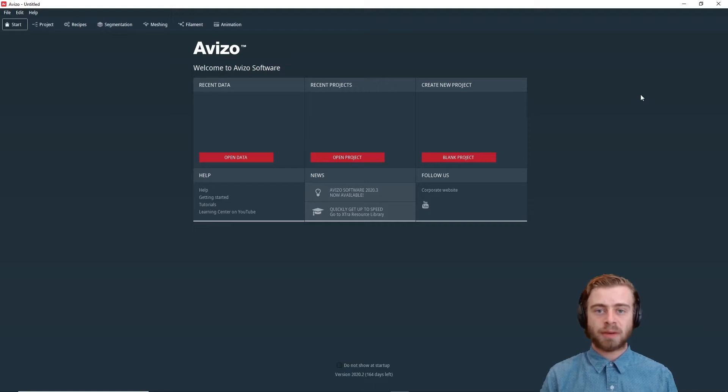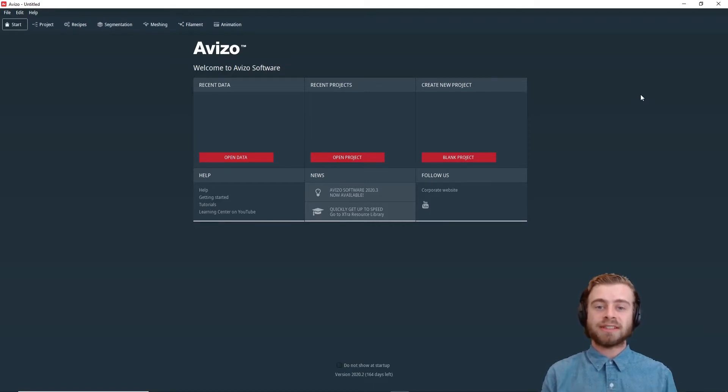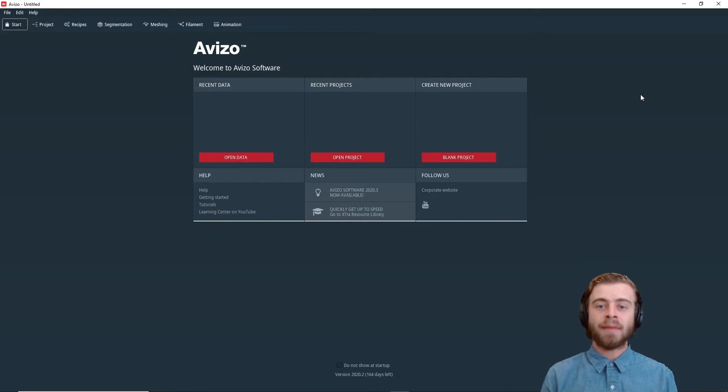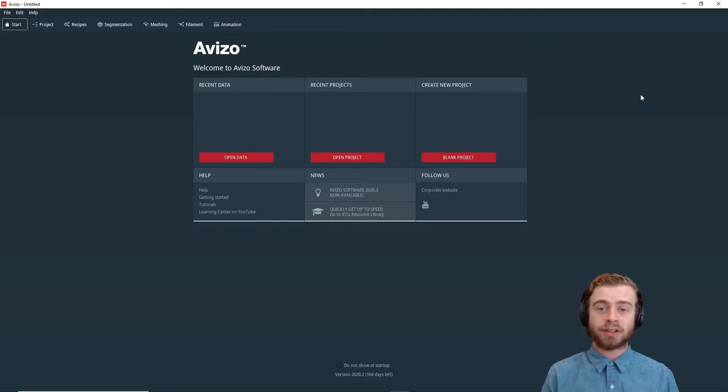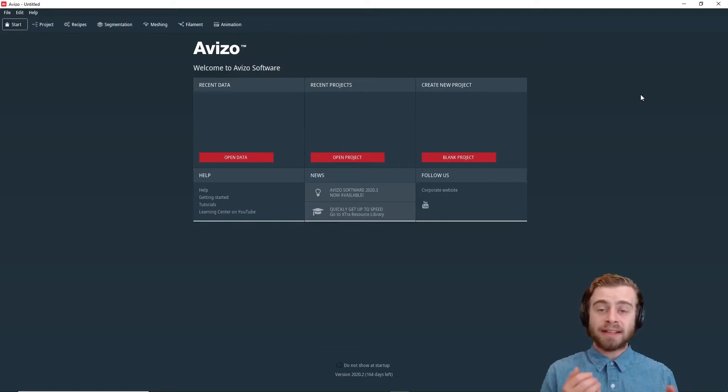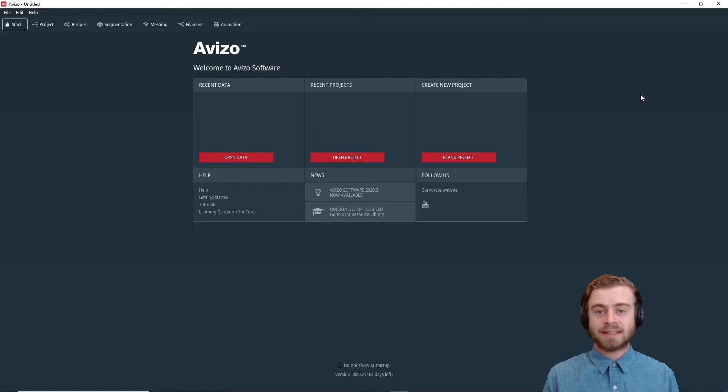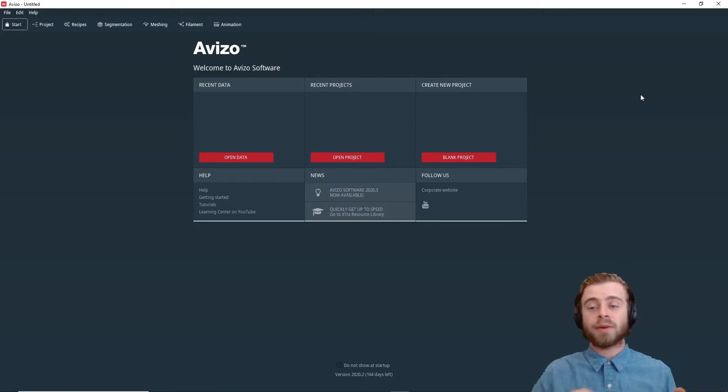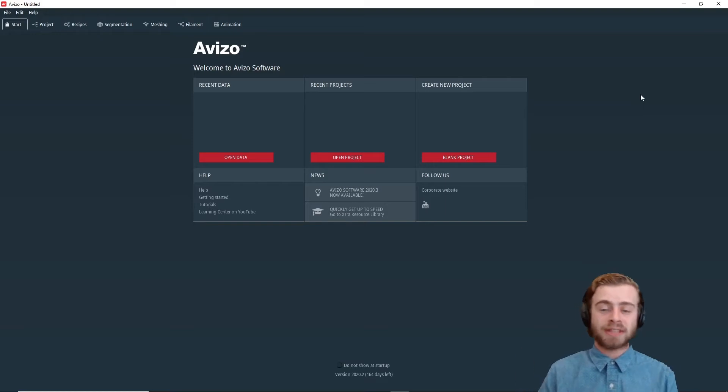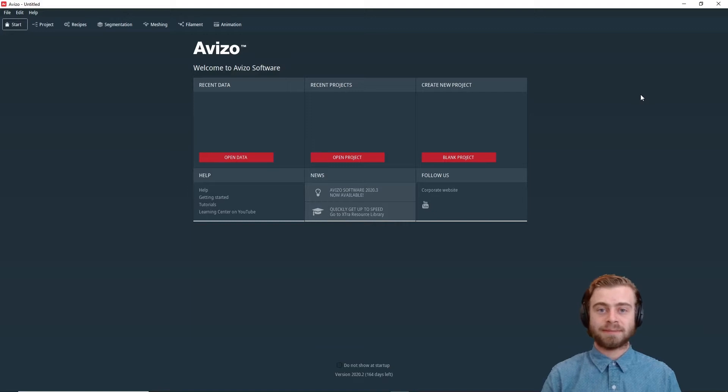The Image Stack Processing module allows you to create a workflow using just a single slice of a dataset and then apply that workflow on the rest of the dataset. This allows you to very quickly iterate on your ideas. So instead of running each filter or each operation on the entire dataset at once, you can just run it on a single slice. Then the Image Stack Processing workflow will allow you to run it on the rest of the dataset once you're satisfied with the result. This makes it much faster and more convenient to try new things.